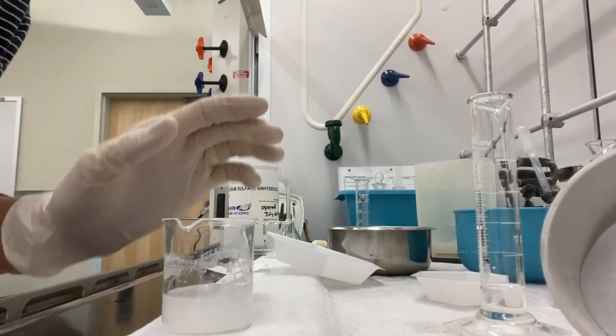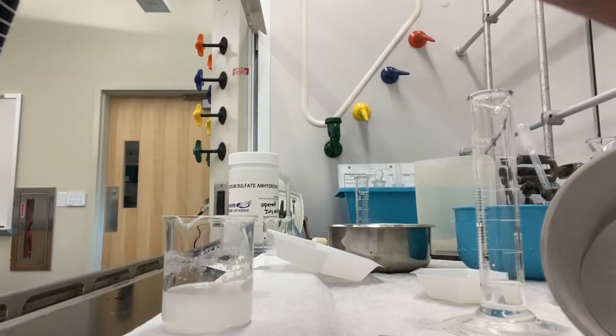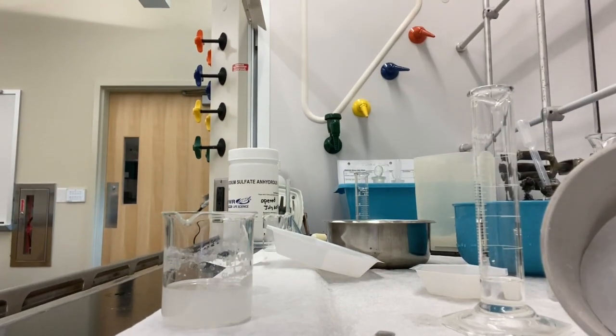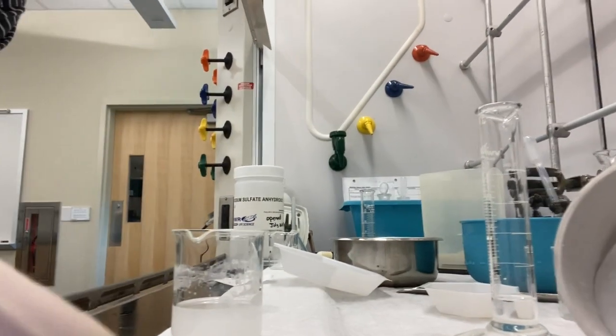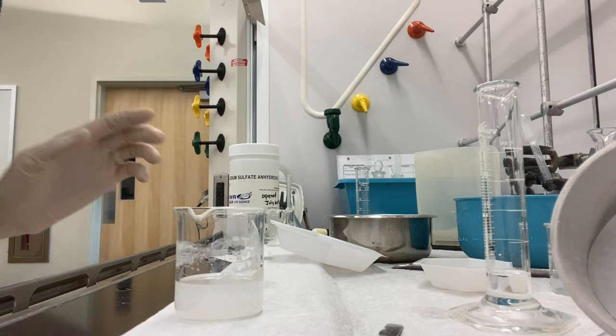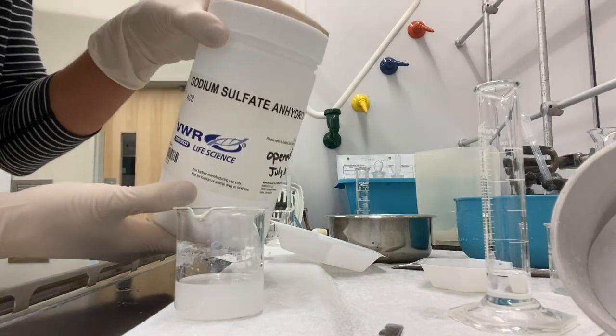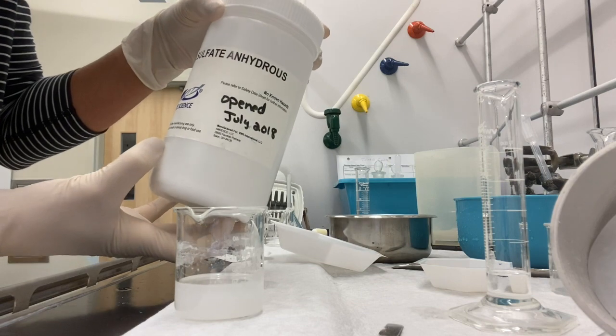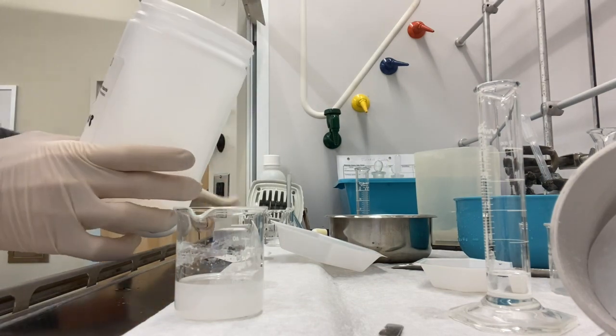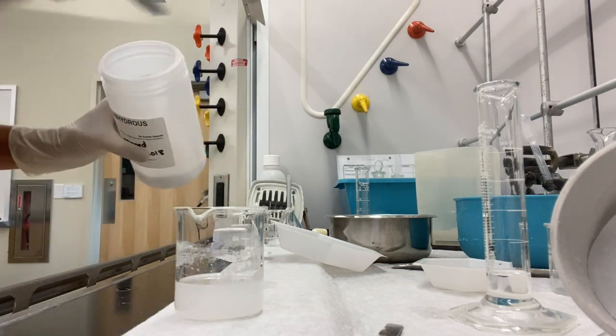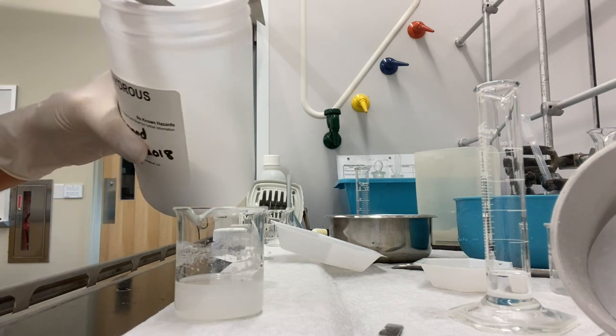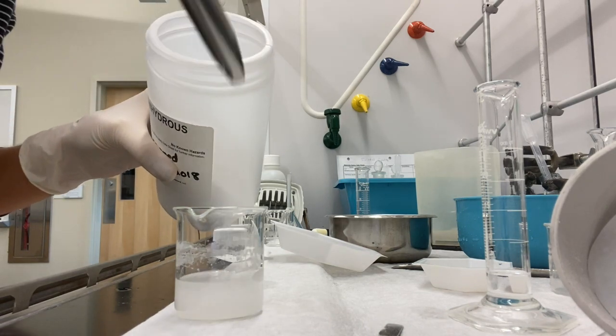So the way that we can fix that is by adding some drying agent. And so what we're going to use is something that's going to soak up that water. And for this experiment, we're going to use sodium sulfate. You see it's anhydrous. So this sodium sulfate, once we add it, will stay solid. It won't dissolve. It'll just sit on the bottom.